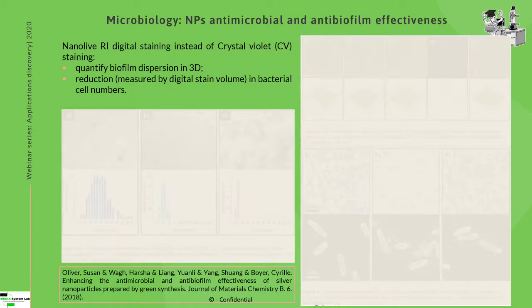So you can see on the left, we have some nanoparticle distribution evaluation. In this case, I really recommend you to follow also our webinar about transmission electron microscopy to determine the morphology of those nanoparticles and to characterize them from the morphological point of view, analyzing the dimension, making distribution.